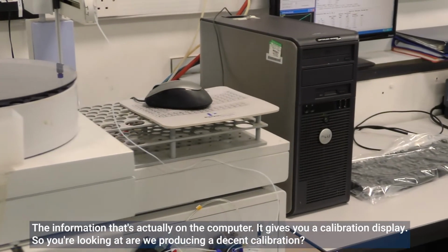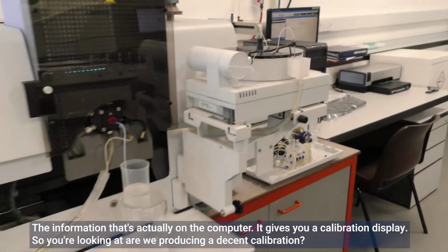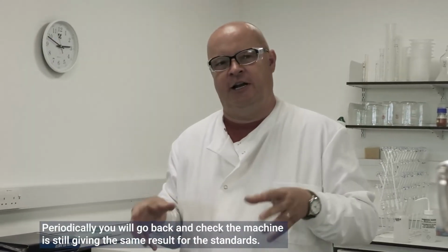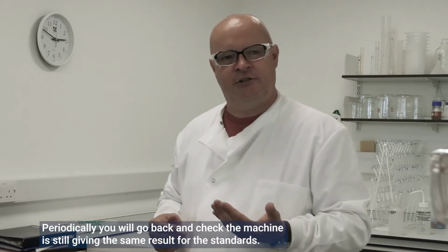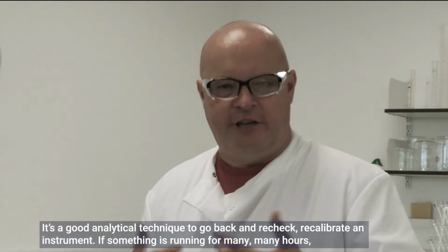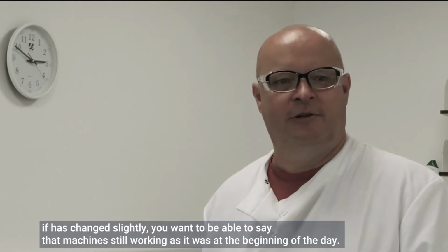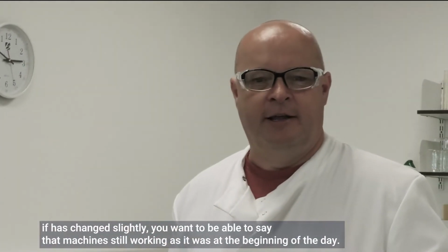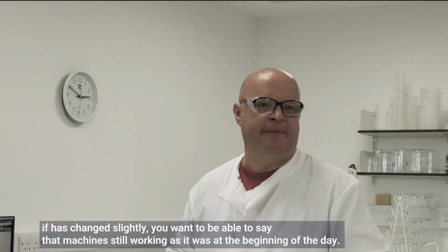The information that's actually on the computer will give you a calibration display, so you're looking at, are we producing a decent calibration? Periodically, you'll actually go back and check the machine is still giving the same result for the standards. It's a good analytical technique to go back and recheck, recalibrate an instrument. Because if something is running for many, many hours, and something has changed slightly, you want to be able to say the machine's still working as it was at the beginning of the day.